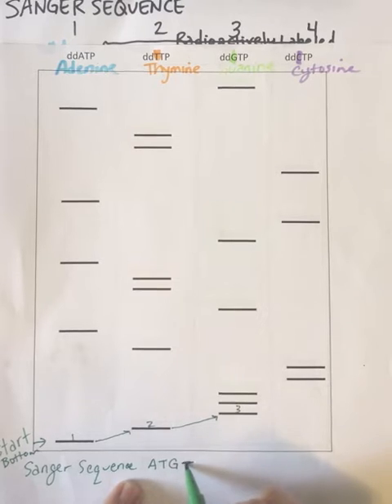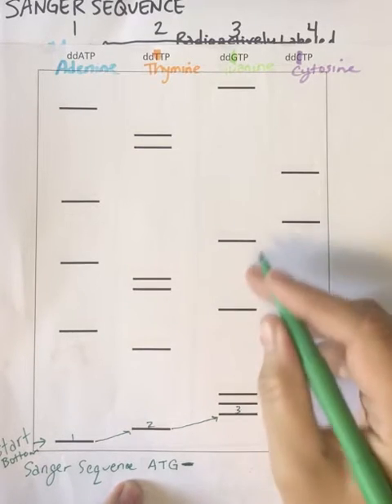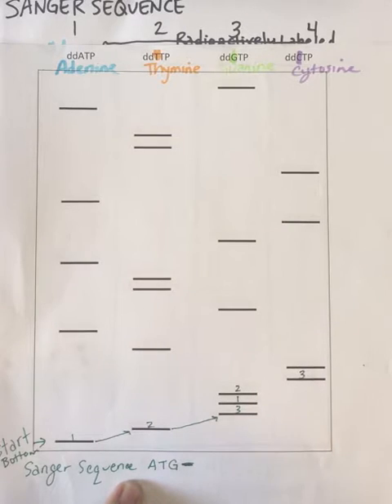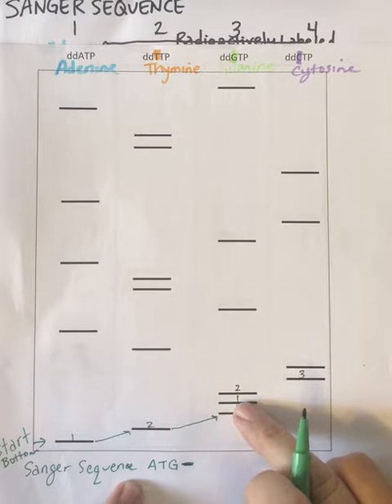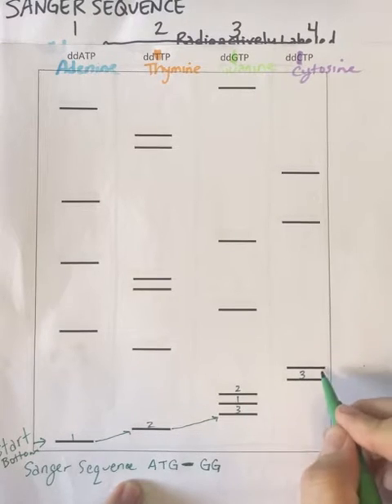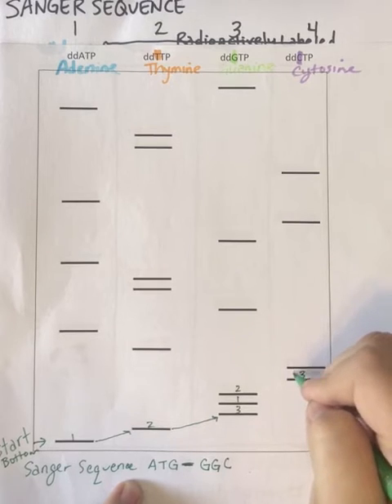So then you draw a little line because DNA is always read in sets of 3. So you go to the next lowest one, which falls under guanine. 1, 2, 3. I like to do mine in sets of 3. So you have 2 guanine, so it'd be G, G, and then over here, cytosine. That's 1, 2, 3. Now you go up.